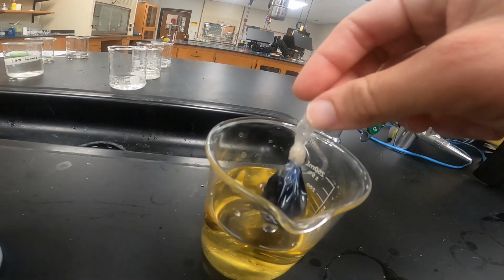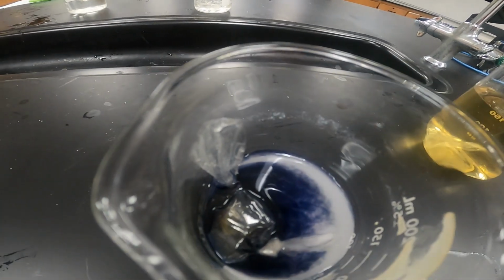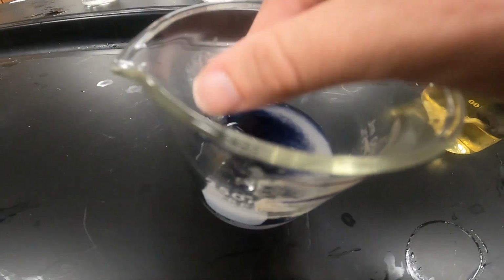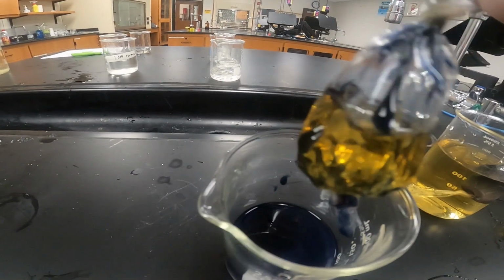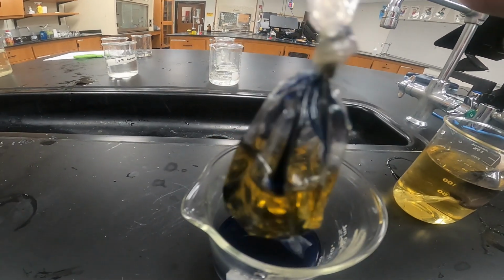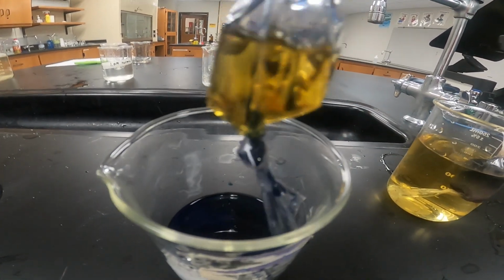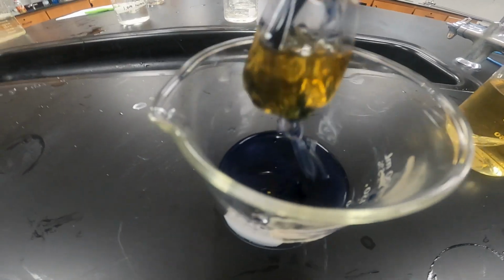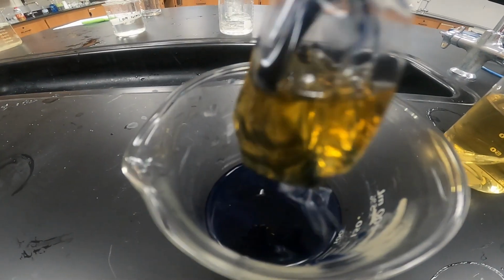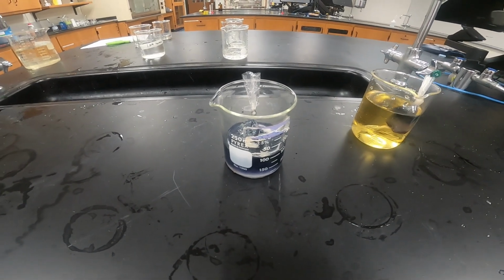So that's experiment 1A. If we look at 1B, around the balloon you can see the solution starting to change to that purple color, same as what we saw inside the balloon of the other one. If we pull our balloon out though, you can see it still has that golden liquid on the inside. If we rinse it off, we could get that purple appearance, but that's just from the bag being inside that liquid. Inside, you can see it's still a golden color. So again, that indicates iodine was able to move outside the bag and into our beaker. However, the starch that's inside the beaker was not able to move inside the bag. We'll catch you on part 3 in about 10 more minutes.